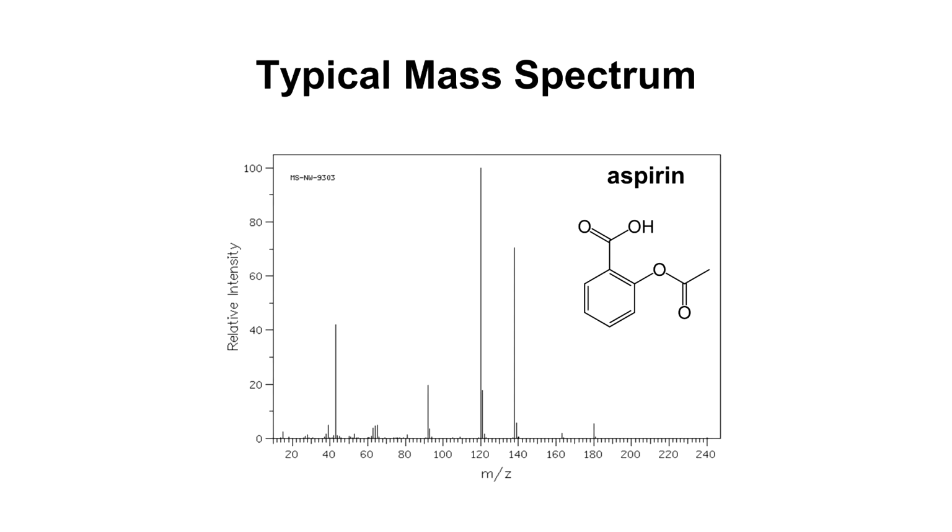So a mass spectrum, if it's done through electron ionization, where there's fragmentation that's happening because electrons are colliding with the molecule, or a mass spectrum taken from a triple quad mass spec, will produce this sort of thing. Very, very sharp peaks, much sharper than what you see with HPLC or GC. And these peaks are not measured according to time, they're measured to mass to charge. And this is the parent ion molecular weight of aspirin. And then what you're seeing are peaks corresponding to different fragments of that aspirin. And aspirin breaks up in a predictable way.